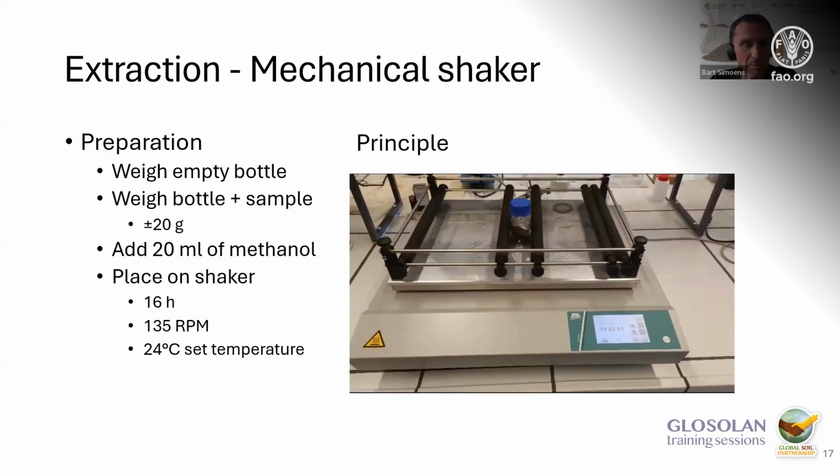We will play a little bit with the shaker. We probably will start some samples before you come as well, so that they are finished when you arrive, and then you launch some. But this is basically a tool that is very easy to use, with the disadvantage for RDX and methanol that we saw in the beginning of the presentation, of course.